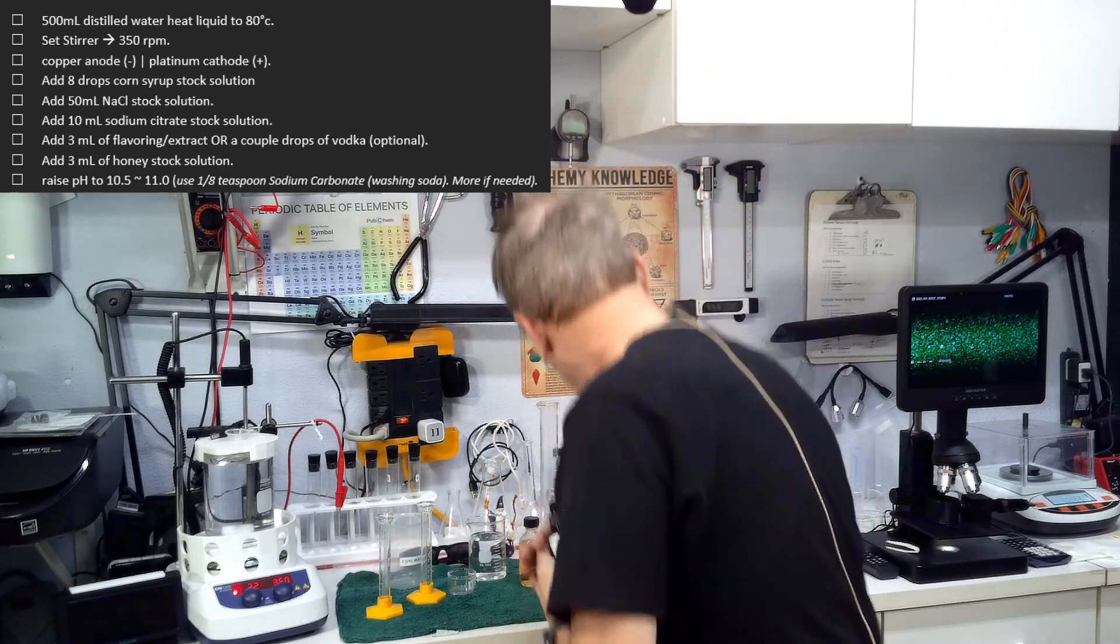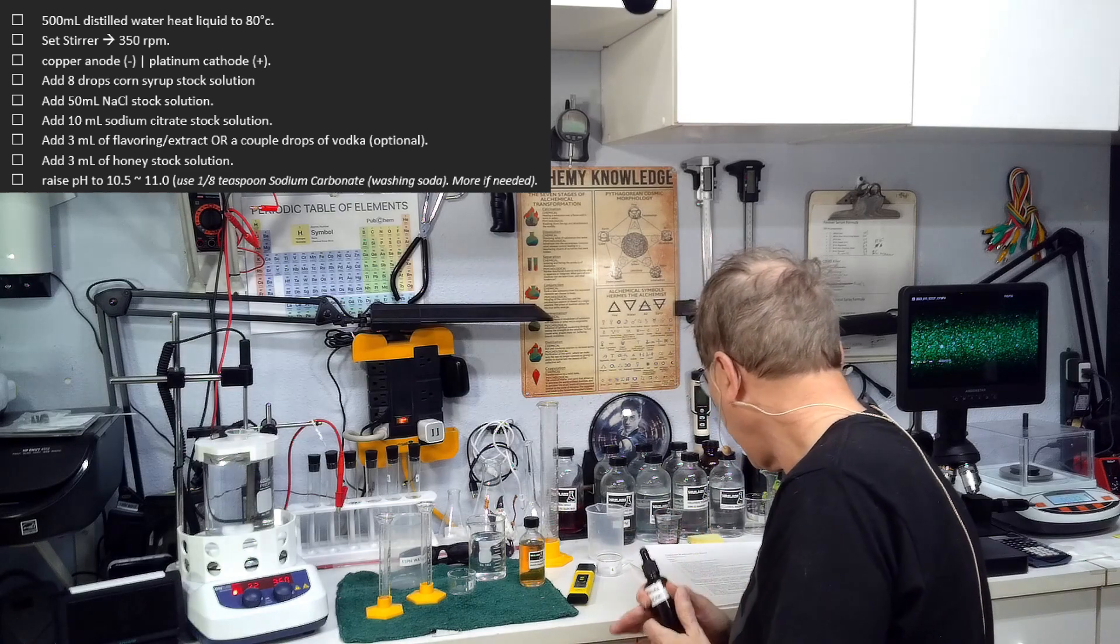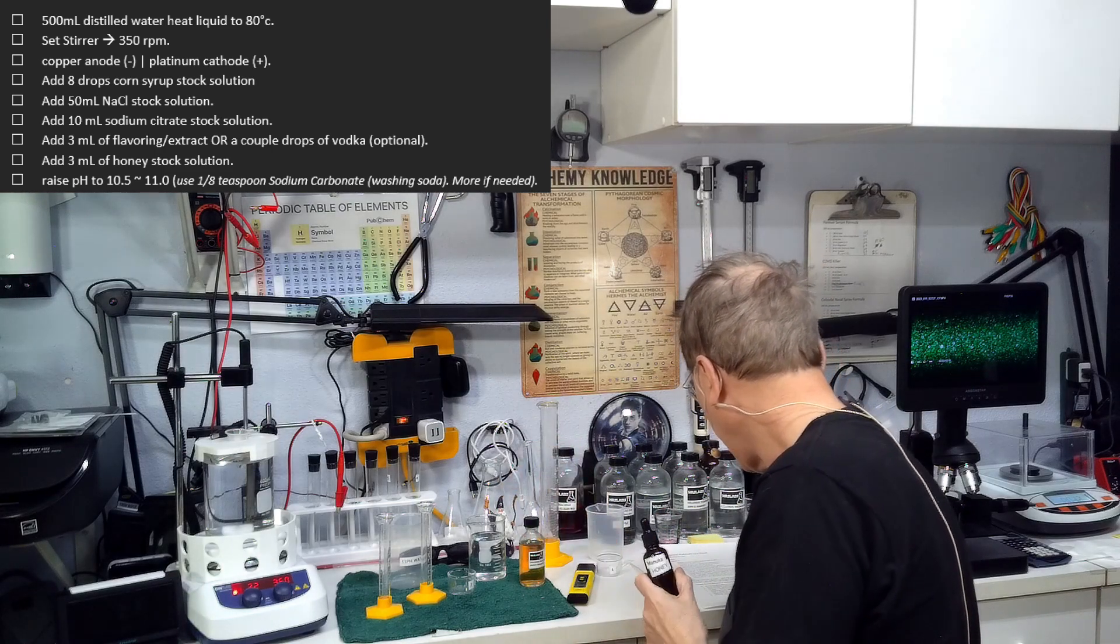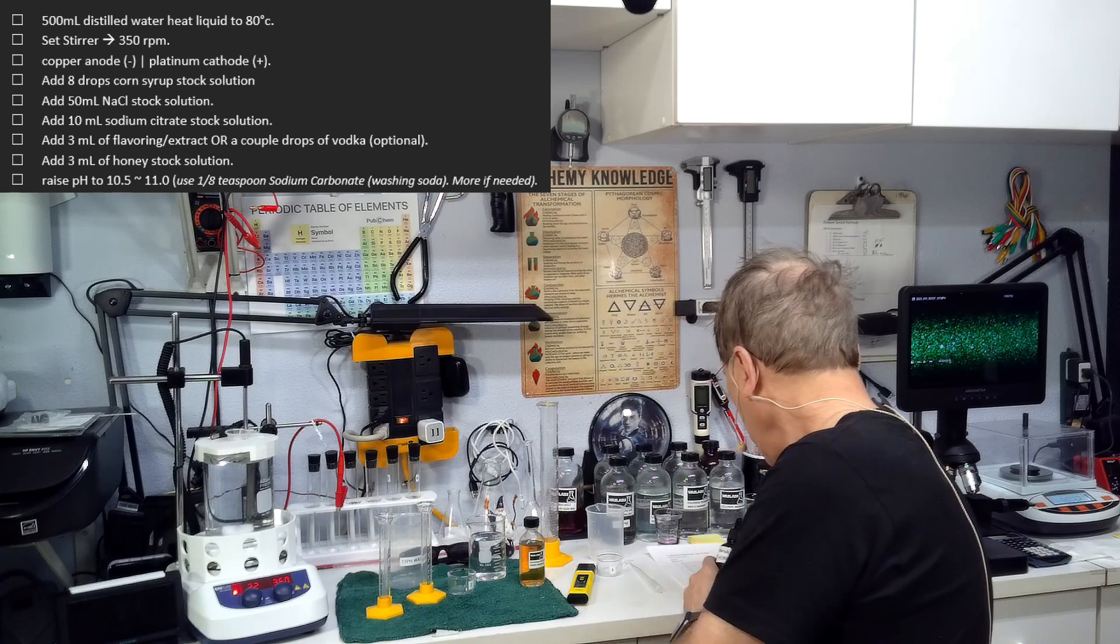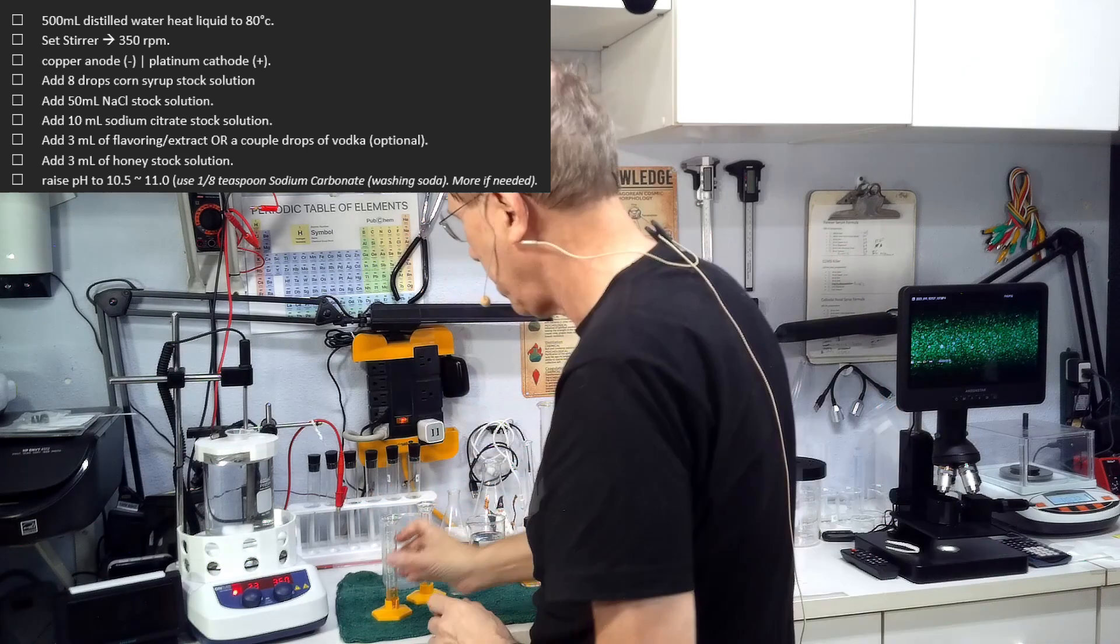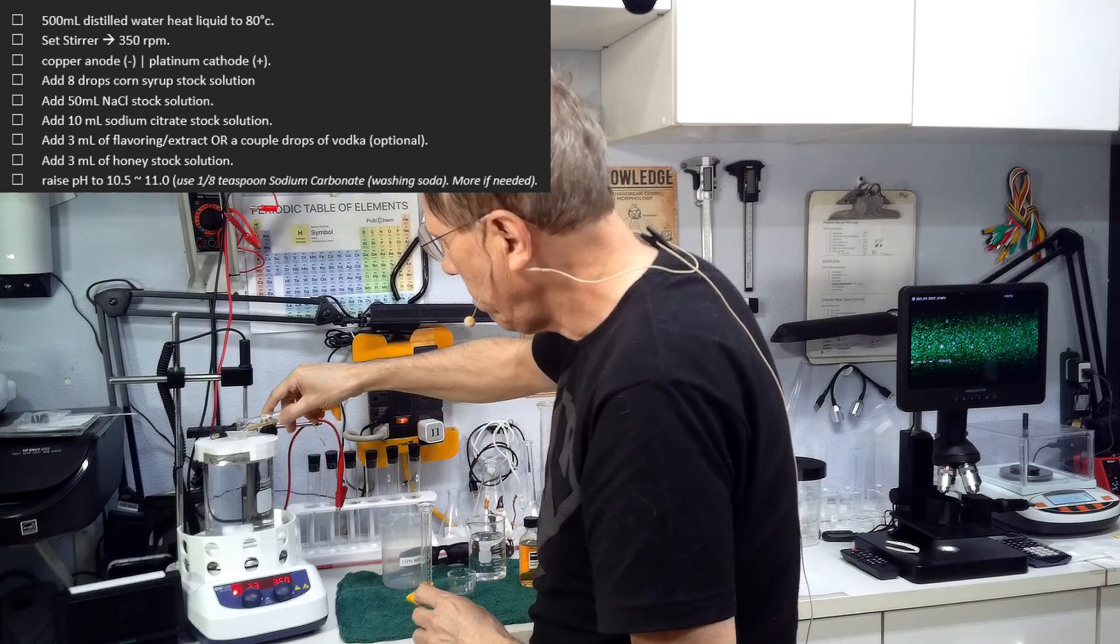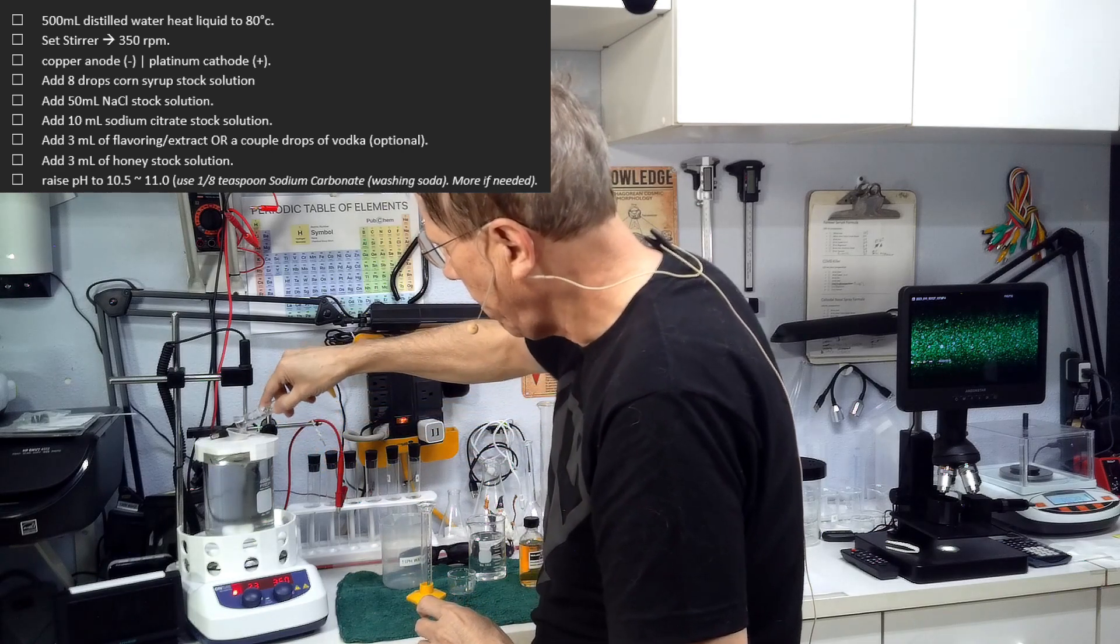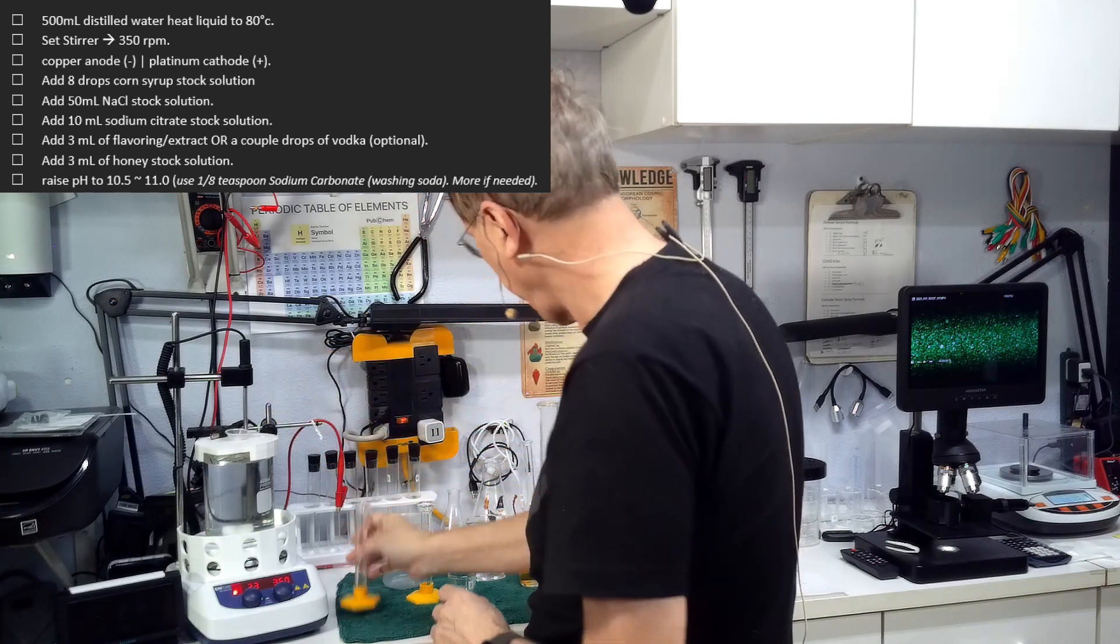Honey, I use Manuka honey because it's a little bit more efficient, but regular honey will work as well. This is a 50-50 mix of honey. We need three milliliters of honey and we're going to pour that in there. Let that all mix together very nicely.